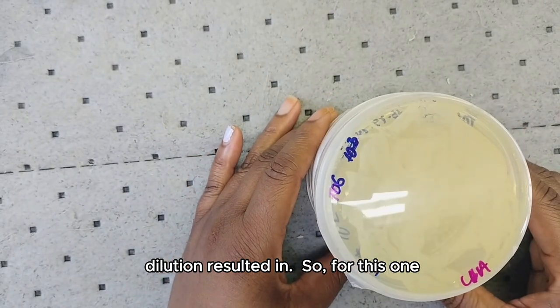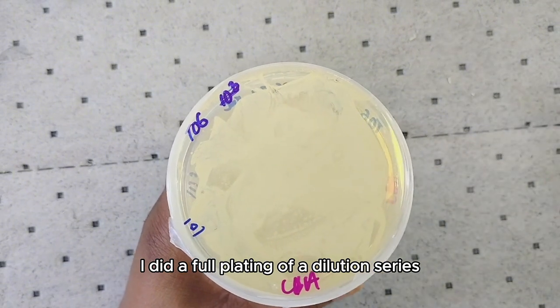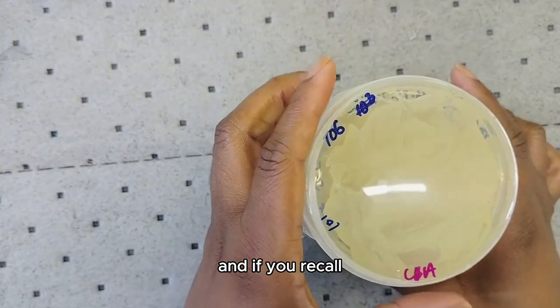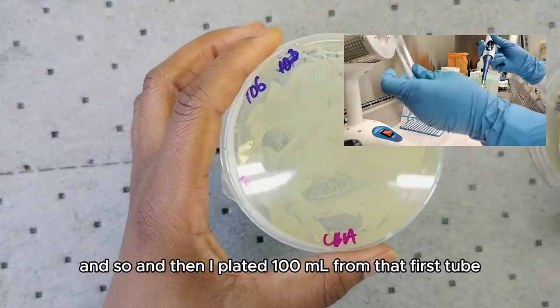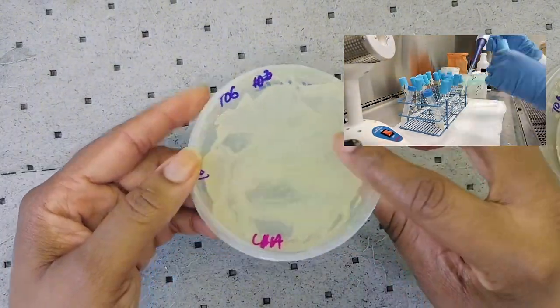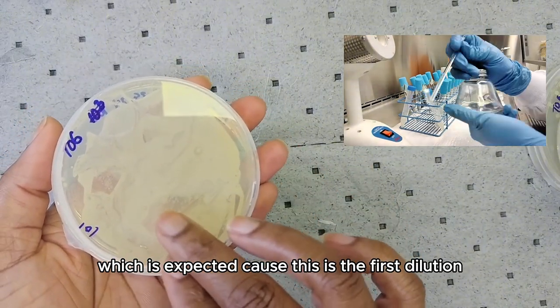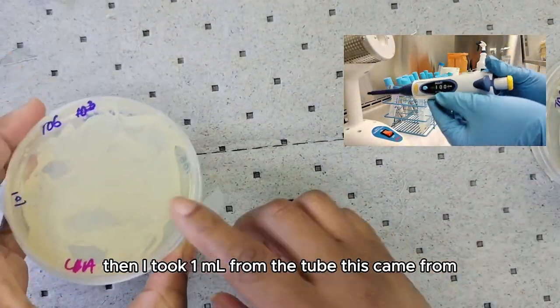For this one I did a full plating of the dilution series — I had one to six, so six tubes, not including the original tube with the sample that had about 1 mL. I took 1 mL from my sample and put it in 9 mL of water, then plated 100 µL from that first tube. As you can see it looks like a smear — it's too concentrated, which is expected because this is the first dilution.